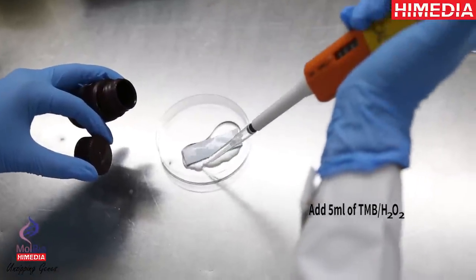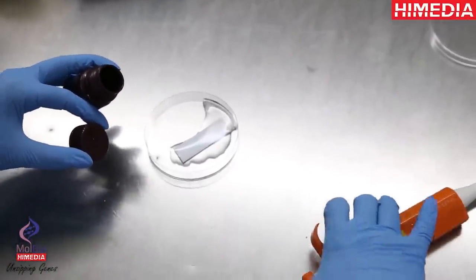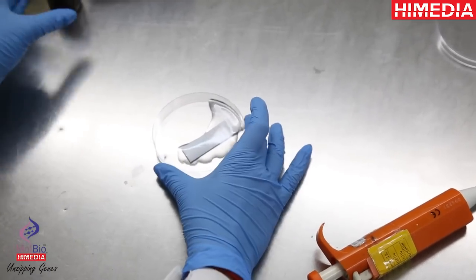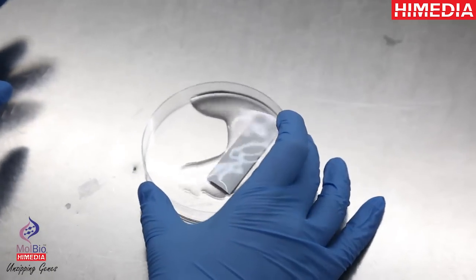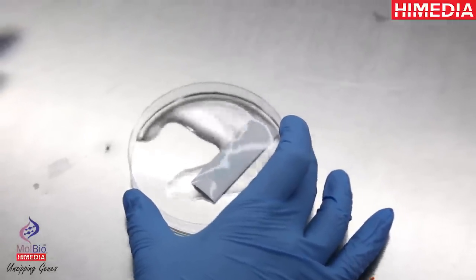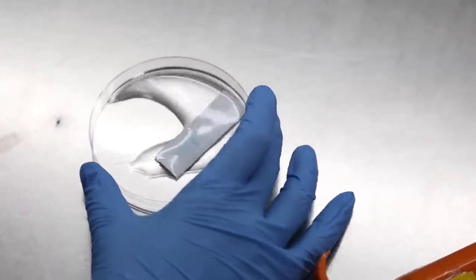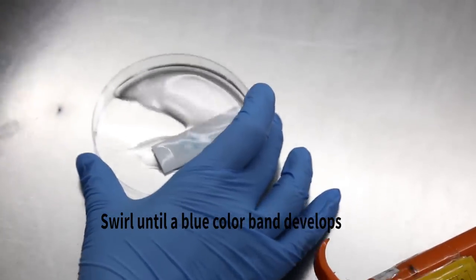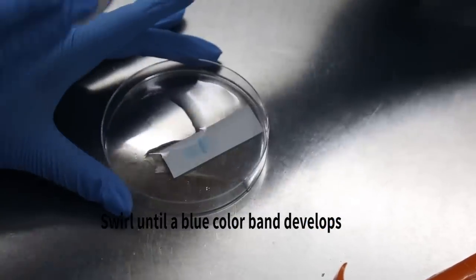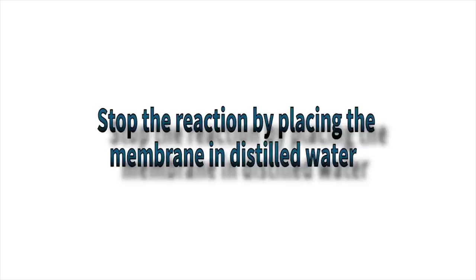Add 5 ml of TMB per H2O2. Swirl until a blue color band develops. Stop the reaction by placing the membrane in distilled water.